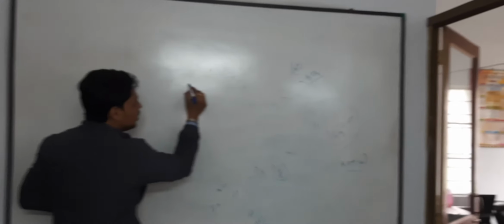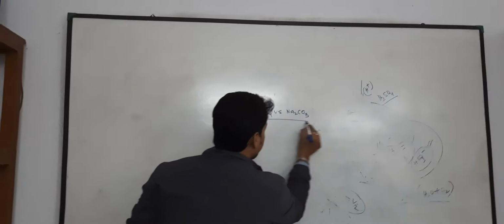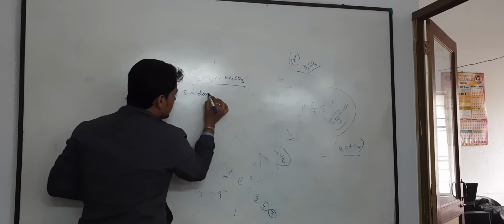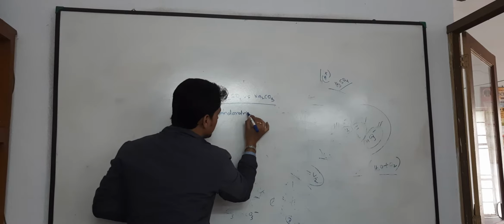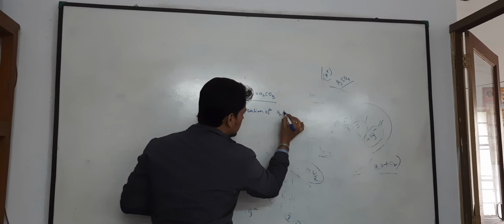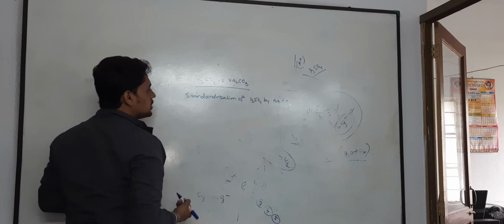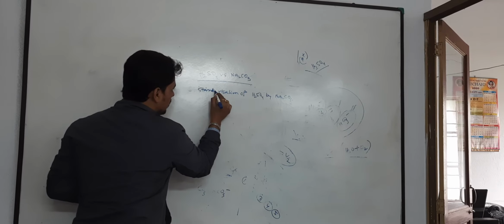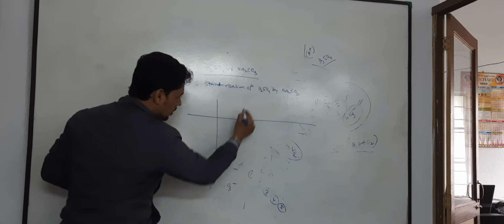Here also, the first heading is H2SO4 versus sodium carbonate, and the process heading is standardization of H2SO4 by sodium carbonate.